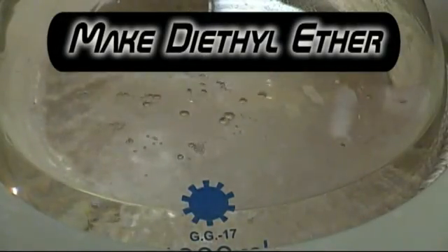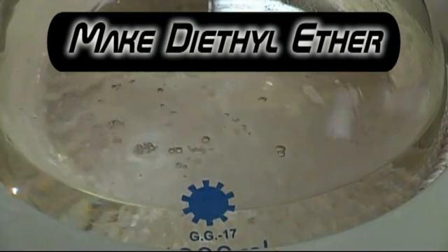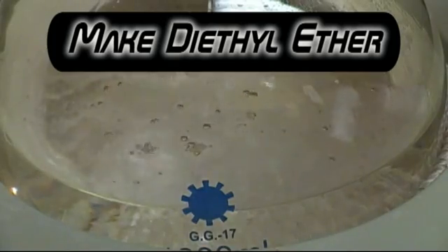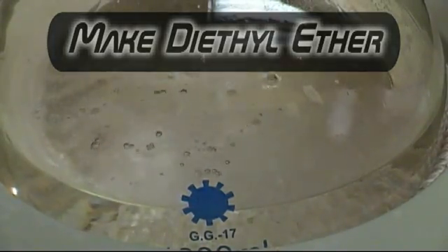Welcome back everyone. In this video we'll be making diethyl ether, an extremely useful solvent especially for organic extractions. There are several great videos on YouTube on the synthesis of ether, however I plan to use ether in a lot of my future videos and wanted to be able to reference my own video.